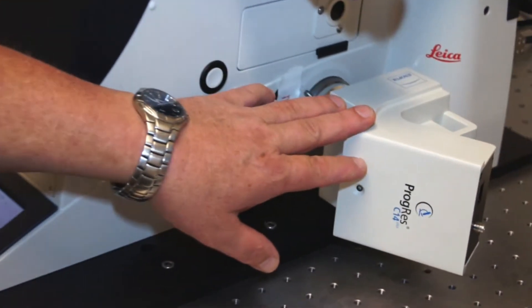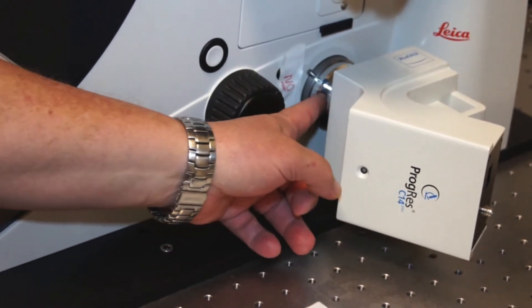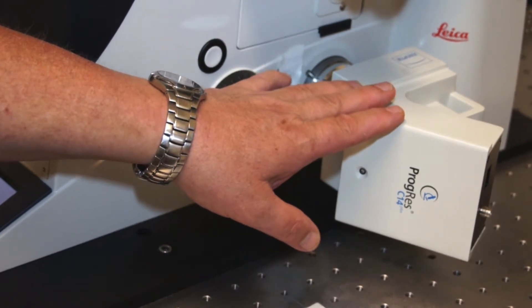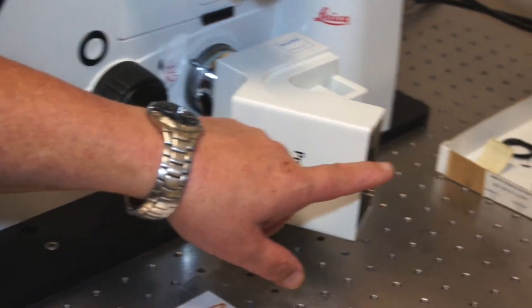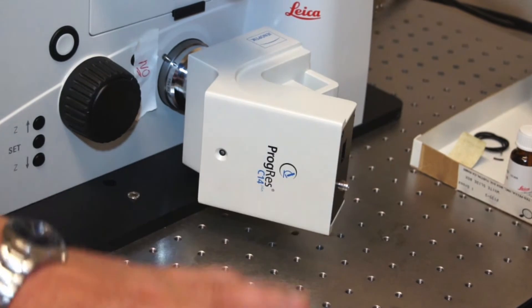We have an attachment digital camera hooked onto the camera port of the microscope, so we can take pictures right off the microscope. We can direct the beam path to go from the viewing port down to the camera port, and by connecting this to a laptop via a firewire cable, we can take pictures right off the microscope onto a laptop.